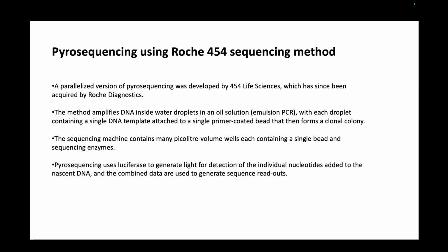So now we come to what is known as pyrosequencing. It uses the Roche 454 sequencing method. Pyrosequencing was developed by 454 Life Sciences, and later it was acquired by Roche Diagnostics. It amplifies DNA inside water droplets in an oil solution, which is emulsion PCR, with each droplet containing a single DNA template attached to a single primer-coated bead that forms a clonal colony.